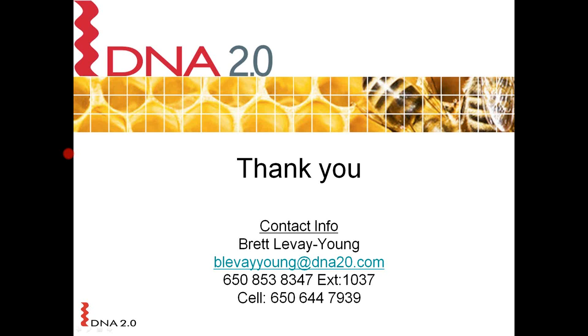After you have that data, you can then think about, okay, so now I have, let's say in those 10 positions, a total of 5 to 10 substitutions that make small improvements in the function of my protein. Now I want to combine those substitutions into a single library, where I'm looking at a combinatorial site substitution library, and you can then say, okay, now if I screen this, will I get larger improvements in the function of my library, my protein, my gene?